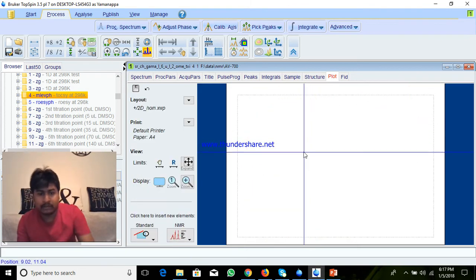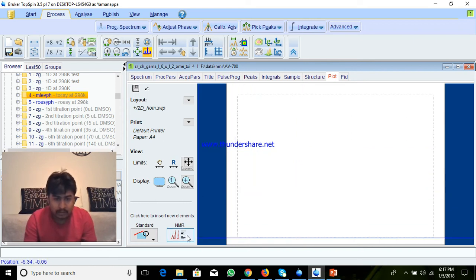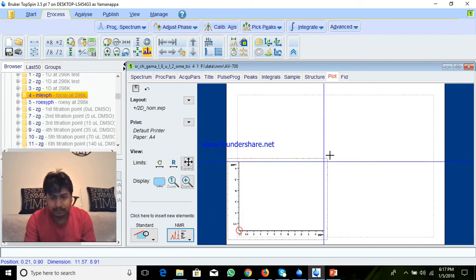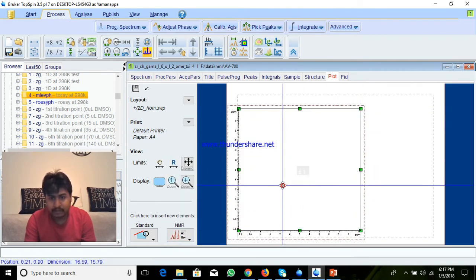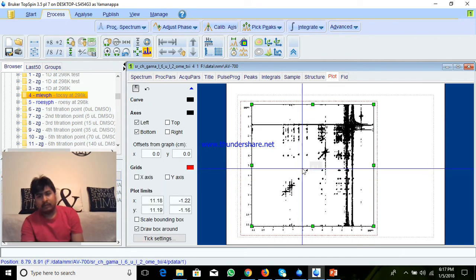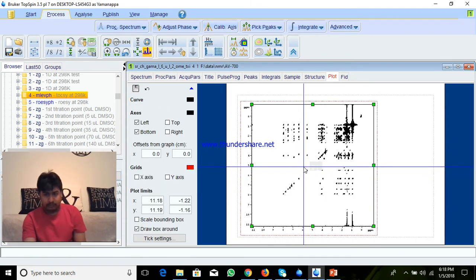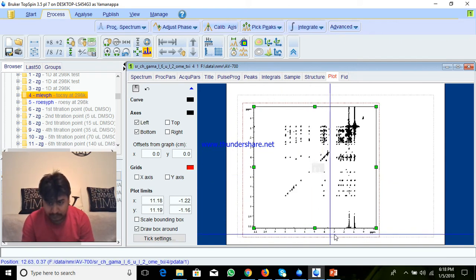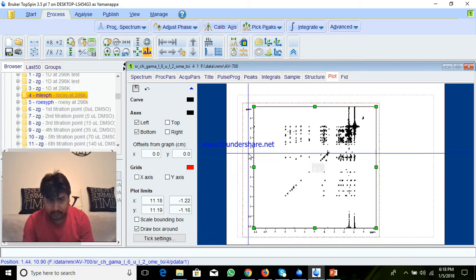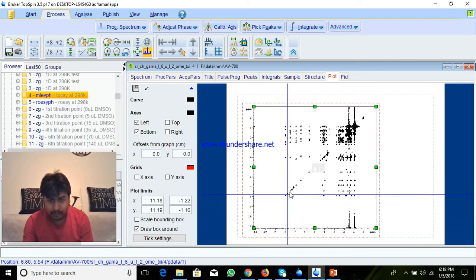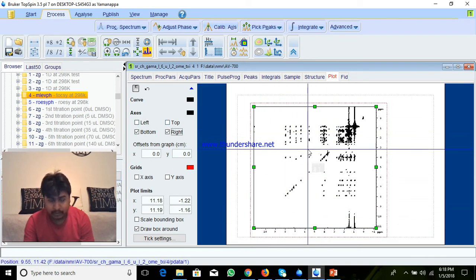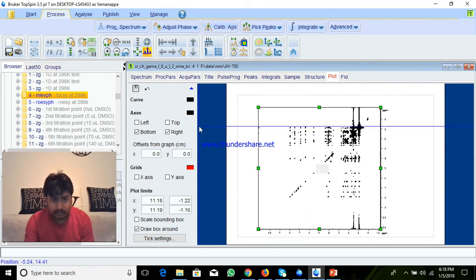Here you have axis at the right side, left side, and the bottom. I want to change the axis from left to right, because I want to add the projections on the left and top. Here you can change the line width and color, and also font size and different fonts you can use. If you give OK, those are changed. And you can use grids if you want — for a different axis you can change the grid.